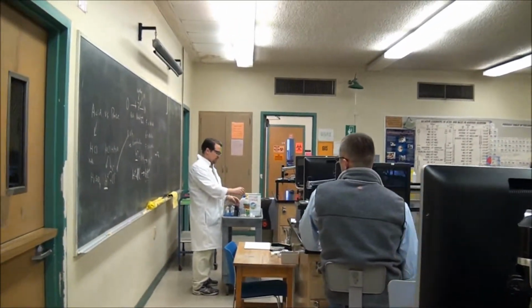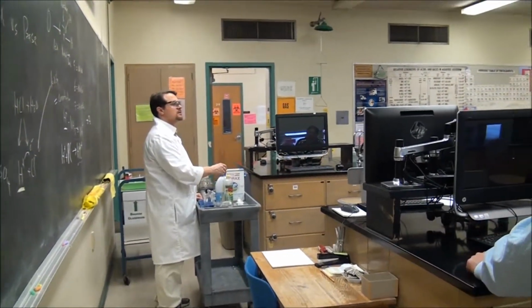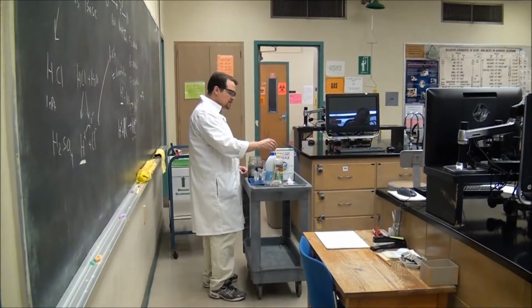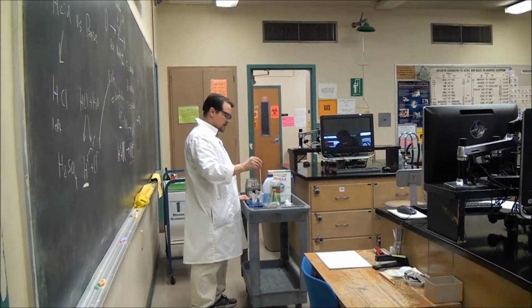Is that the same stuff as yesterday? Yesterday? No. This is, oh yeah, that stuff I poured in for the hydrolysis of water. So which same stuff is this? Yeah, when we were doing the little acetic acid. Oh yeah, I'm sorry, this is the acetic acid. It's essentially vinegar. So let's check this one out just for fun and let's see what it does.